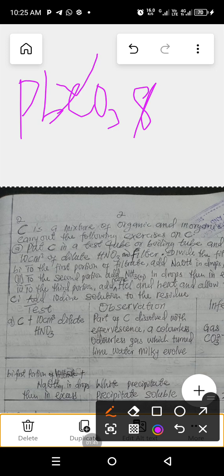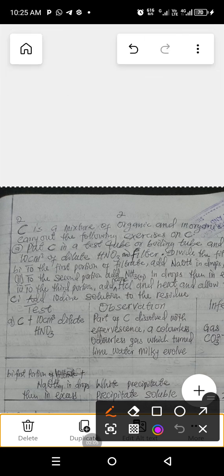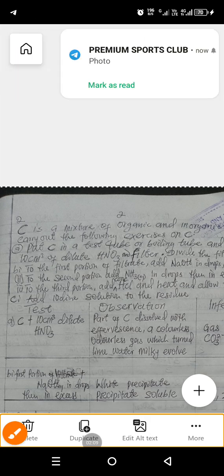In the filtrate, when you filter, what you'll be having is the lead carbonate. So it's very sparingly soluble. But that will be difficult anyway. Exam pattern questions do not assure that. And so you'll be required to dissolve using trioxonitrate(V) acid.